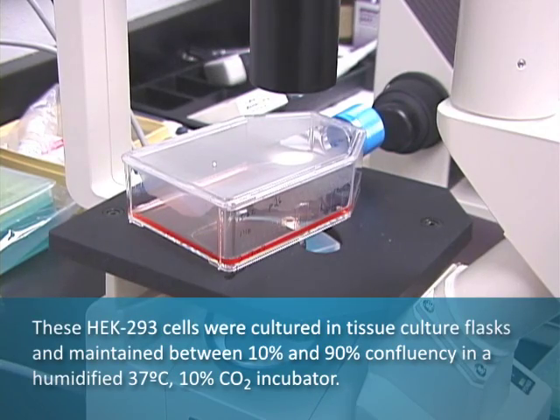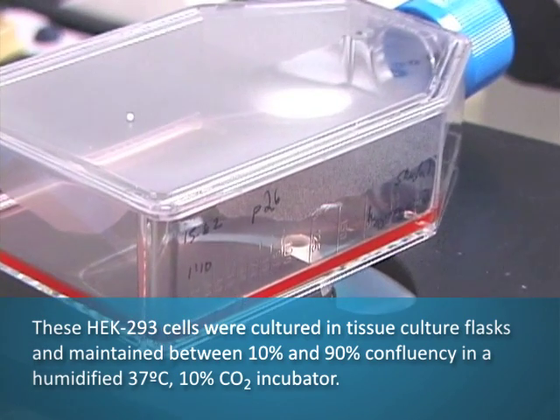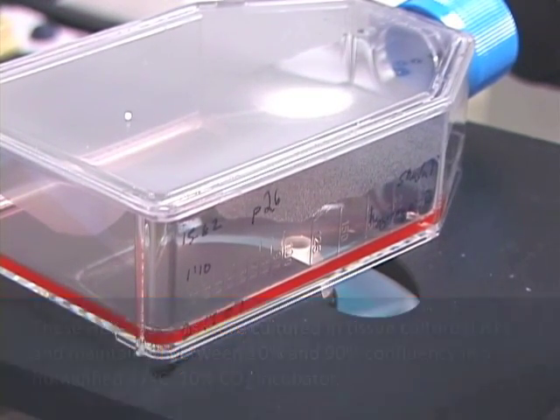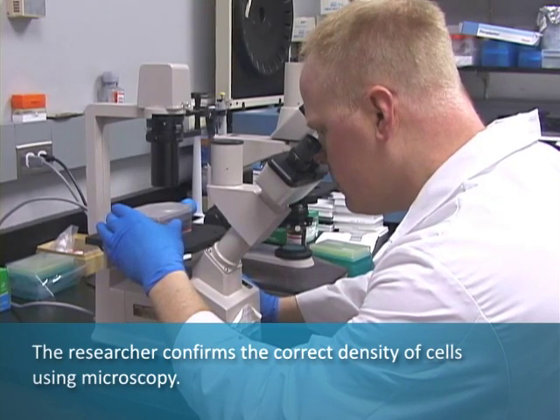These HEK293 cells were cultured in a tissue culture flask and maintained between 10 and 90 percent confluency in a humidified 37 degrees centigrade, 10 percent CO2 incubator. The researcher confirms the correct density of cells using microscopy.